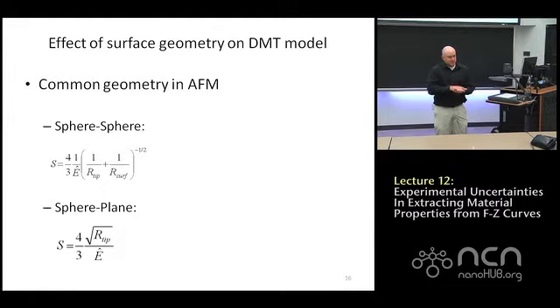The generalization of Hertz for any shaped tip is called the Sneddon model, which is an axisymmetric punch indenting a plane. And they do something called the Oliver-Pharr approach, where they indent way into the sample, then let the sample relax, then withdraw and measure the force very carefully. So when you go to much larger indentations, you deal with that model instead of the model I'm talking about, which is DMT. Does that make sense?